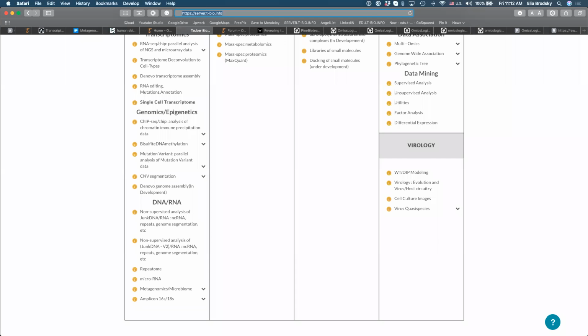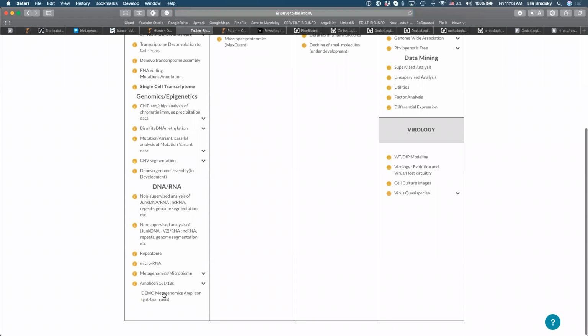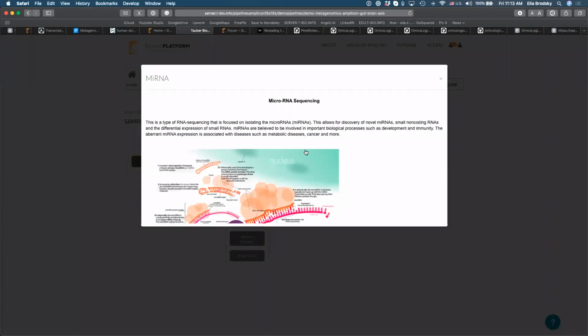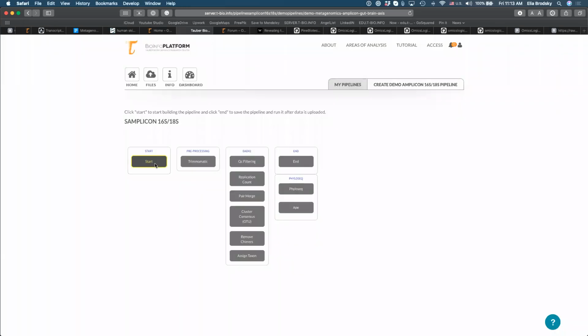All right, excellent. Anyone else? Just one more person. Okay, great. So you go to Amplicon 16S and just click on the demo. And this is what we will reproduce here together.